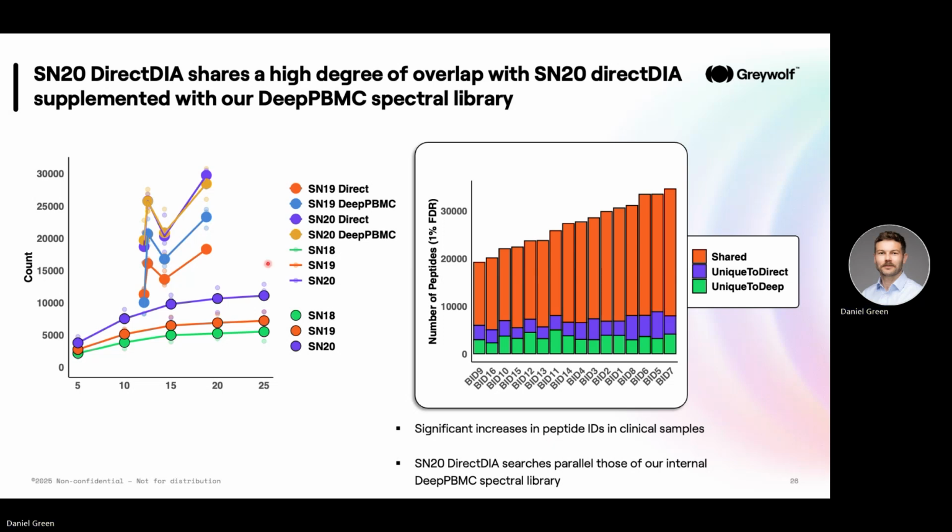So the graph on the left-hand side here is really showing you those search numbers mapped to their relative inputs in terms of PBMC yield. And you can already see that across all searches, we're generally doing better than we expected to do relative to that PBMC titration study.